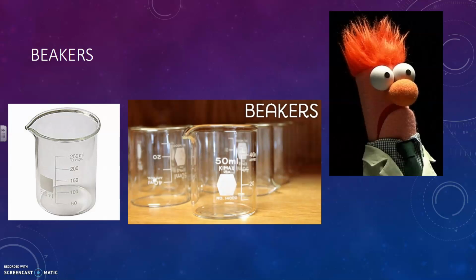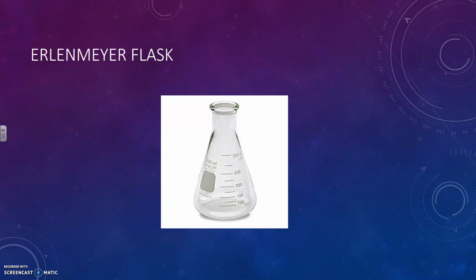These are not for measuring. The constant heating and cooling actually distorts the measurement markings on beakers, so they're there as just a guide more than anything else.